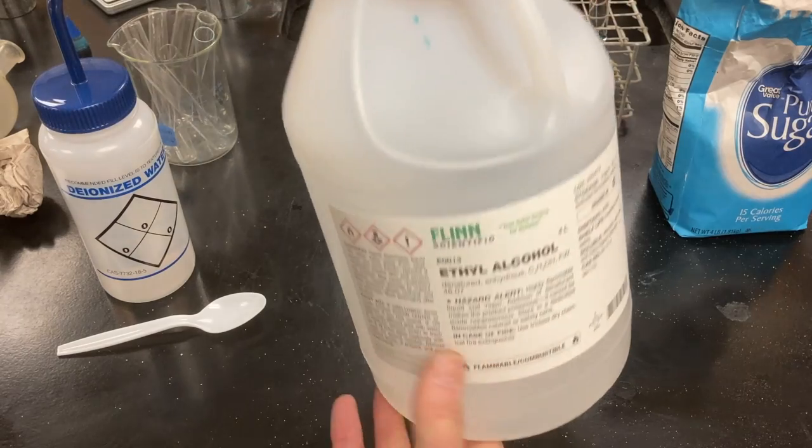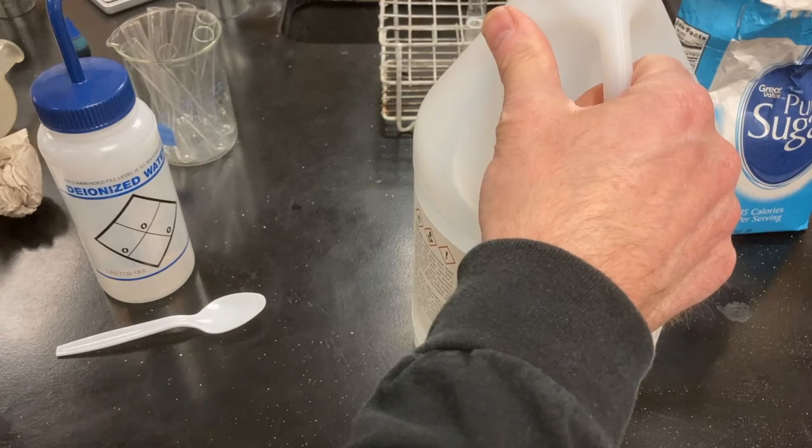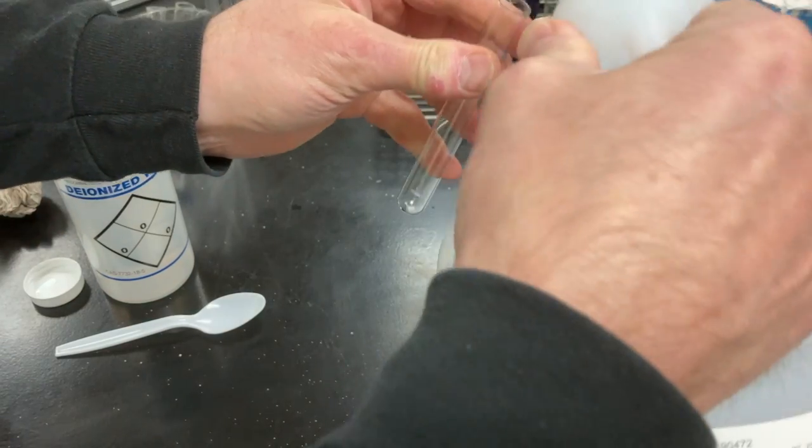Just for fun, I decided to try another mixture. Now I'm taking ethyl alcohol, which we mixed with water earlier, and I'm going to put some of that in my test tube.